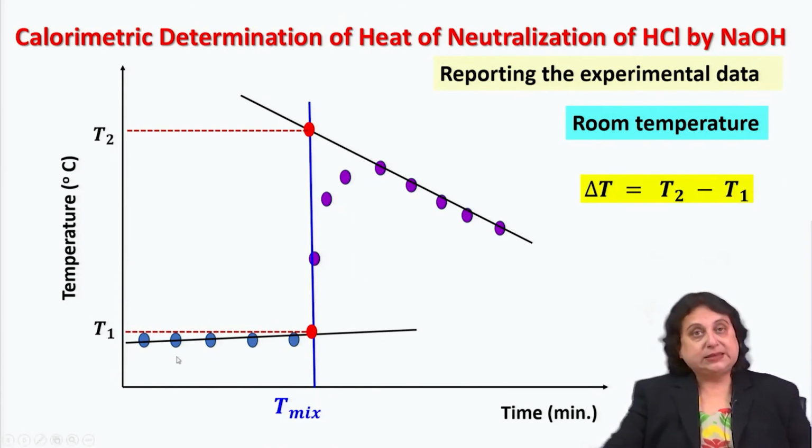Now, after you mixed, because the reaction is very fast, immediately heat starts evolving. Therefore, from inside the calorimeter, the temperature has jumped by about 5 to 6 degrees centigrade. So, you are going on mixing, the lid is still open, and the solution inside the calorimeter is about 5 to 6 degrees hotter than the surrounding air outside. Therefore, a heat flow will immediately set in.